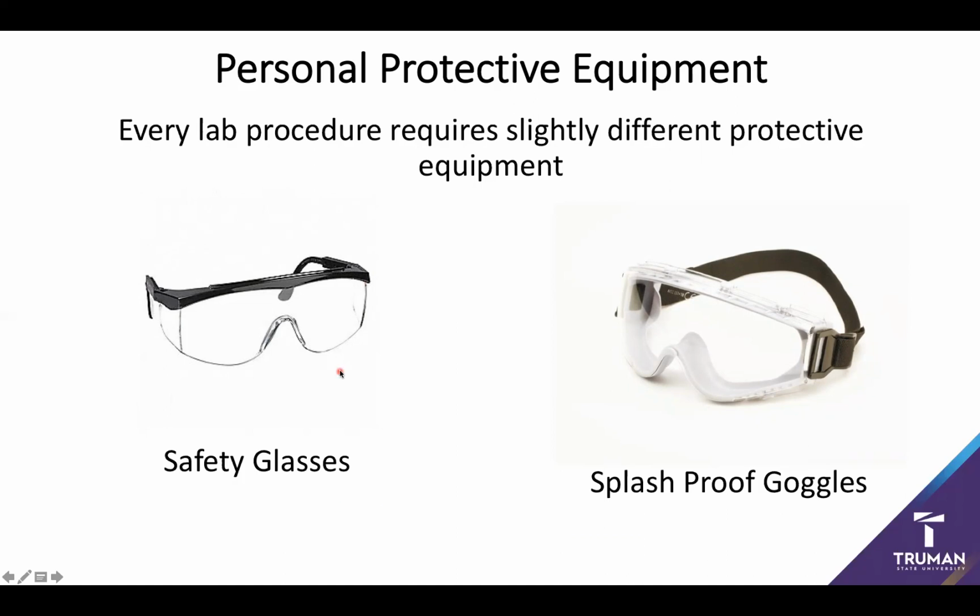So if I'm working on a centrifuge or some sort of piece of equipment, safety glasses are going to be my dominant form of protection, because what I really need is something impact resistant in case something comes loose or I have any particulates flying around. So this is more or less the minimum level of safety gear that you should have in a chemical lab. However, the moment you start working with actual chemicals, and the moment actual chemicals are out, no matter how safe they might seem, you should pull out your splash-proof goggles.